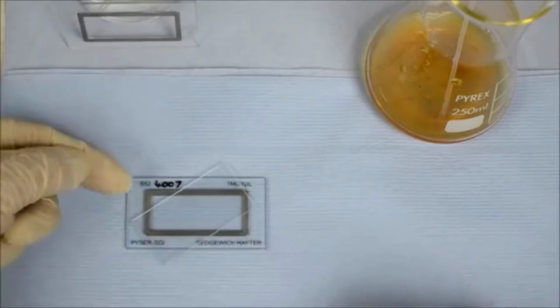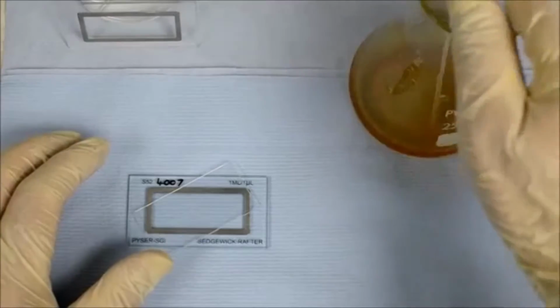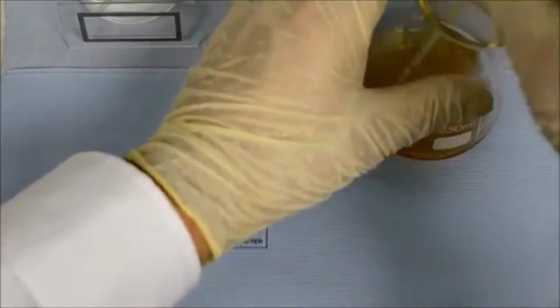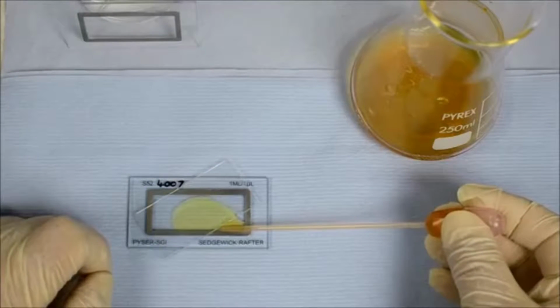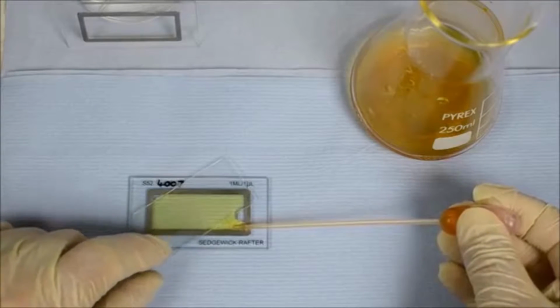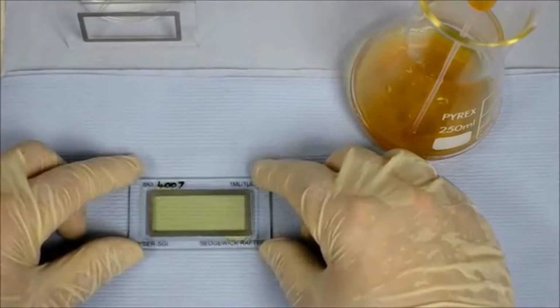So this is one side to fill from and one side to allow the air bubbles to escape during the filling procedure. And this is our sample. So it's well distributed, well mixed, and measure the sample. And we need 1 milliliter, at least, into a wide neck pipette. Okay, and we fill from one edge here, keeping the pipette nice and flat, and just fill through like this. And then turn it, and there we have it. Okay, so that's now full.